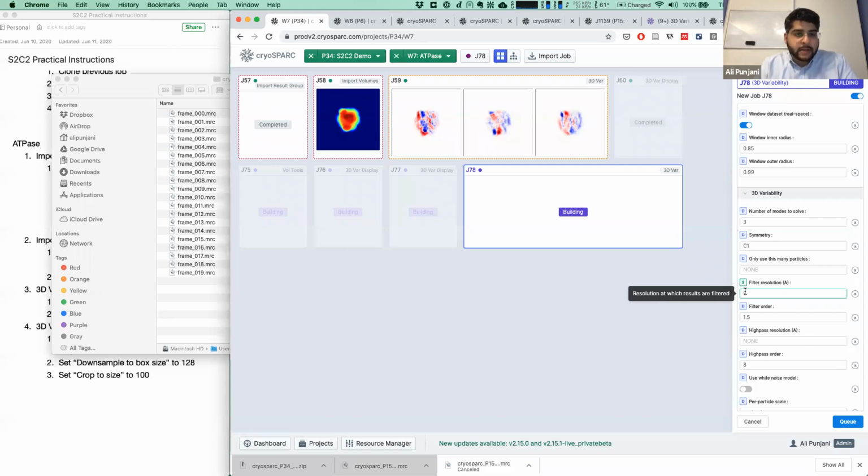And in fact, that may explain the reason that your resolution is limited: you have a huge degree of conformational variability. So I'd say you should try it at any resolution, but if you can already resolve your structure to a higher resolution, that tells you that the amount of flexibility in the structure must be less than what would ruin a structure of that resolution.